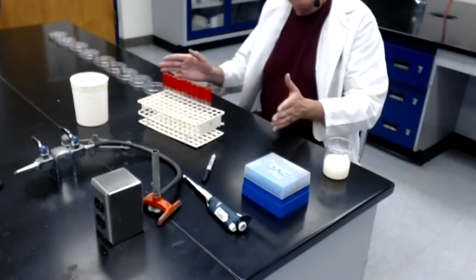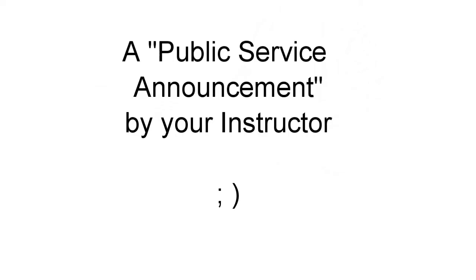Now I'm going to read through the numbers very quickly. Please remember that the dilution numbers that I'm going to be reading to you during this video in the next few minutes are total dilution numbers. In other words, the first tube is a 10th dilution of the milk sample. The second tube is a 100th dilution of the milk sample. The third tube is a 1,000th dilution of the milk sample, and so on and so on.